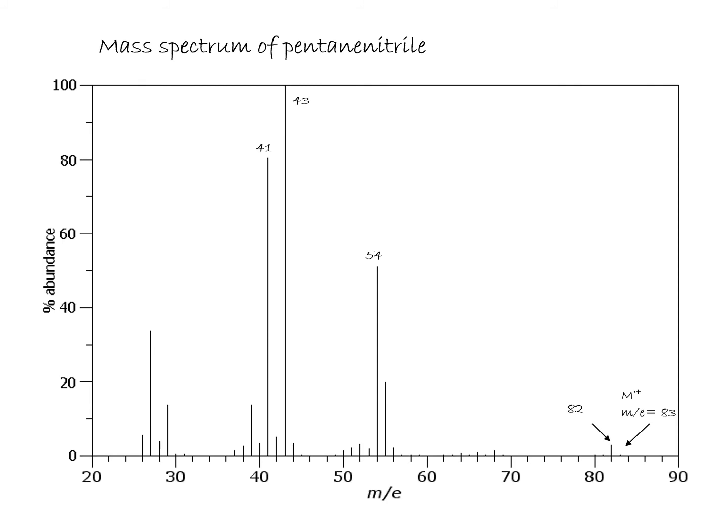This is 43, 41, 54, and the molecular ion. You can see that it's very small, and you can see M-1.